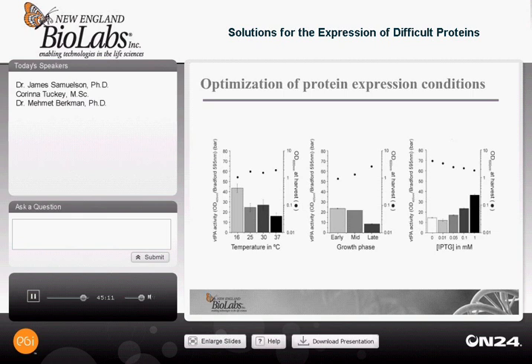For companies that have high throughput expression profiles, they probably know how to express their protein, but your average researcher usually has 3 parameters that they modify: temperature, growth phase induction, do I induce it early or late, and how much should I induce it? Those are the 3 most commonly manipulated parameters. So we thought we should take a test number of proteins and run them through these 3 parameters and find out if there's any obvious pattern or any correlation.